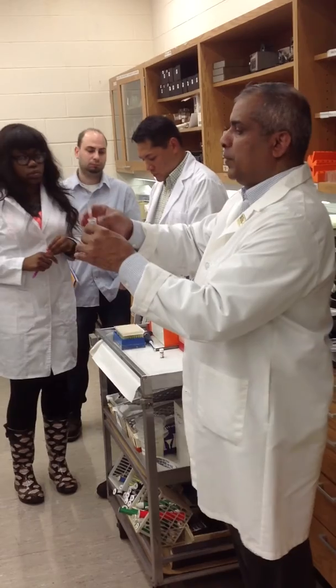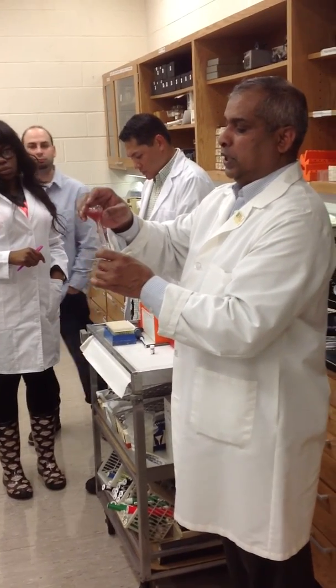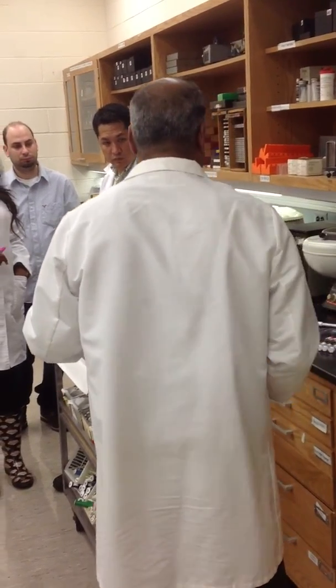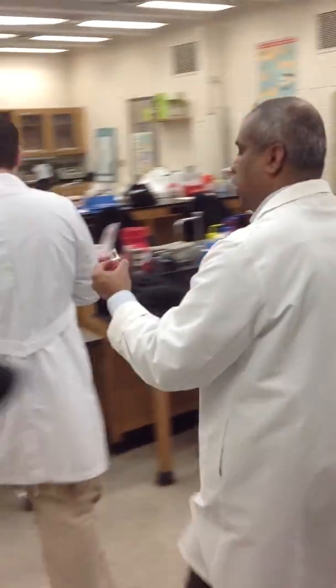Okay. All right, so I'm going to pour this in here so everybody will take from this. It's easier to just get a pipette and do it in here and take from that. All right, so bring your chambers now, and I'm going to show you how to load.